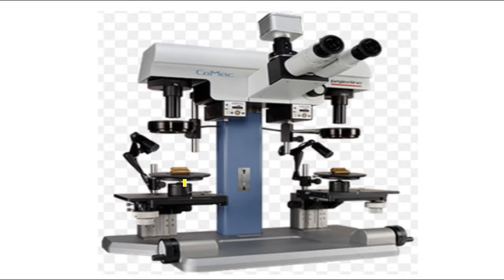You have little adjustments over here, so you can actually turn this around so you can get a different view. If this would be a bullet, you can actually turn it around and around and around, so you can get a view of all sides of the bullet. Same thing over here. If this would be one, you can turn it around and around on the stage. You can move back and forth and forward and back, right and left, even up and down, depending on how well the stage has been assembled. In any event, there are many other settings for this particular microscope, but this is a typical comparison microscope.